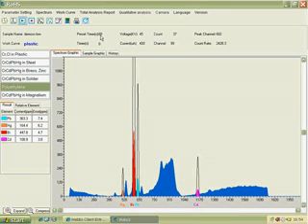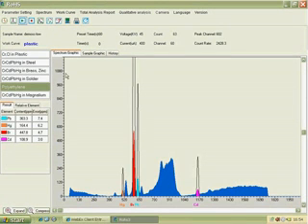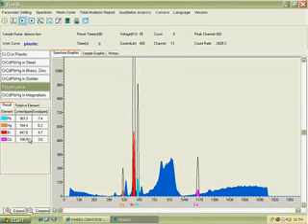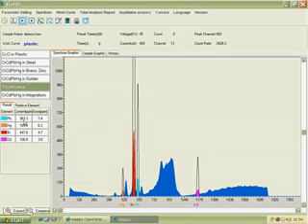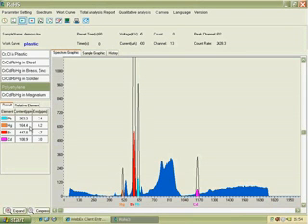Here you can see the results after 60 seconds. Normally for a little better stability of peak structure we would go 100 seconds, but for demonstration purposes we go 60 seconds, and even then the numbers are very close. The cadmium is a 100 ppm standard, the bromine is 500 ppm, the mercury is 200 ppm, and the lead is 400 ppm. You can see everything staying within a 10 to 20% window.